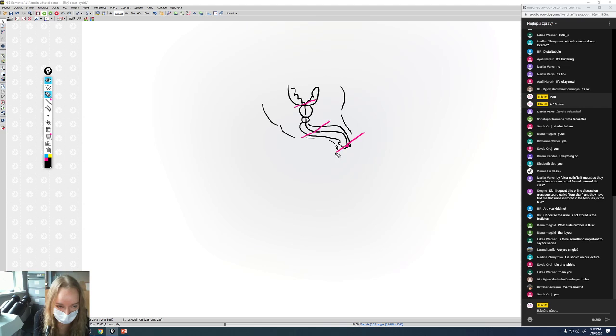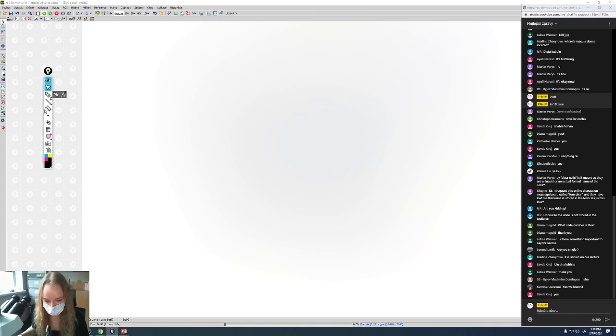And here in the fossa navicularis, I don't know if it's the same in English. Yeah, navicular fossa, thank you. It's going to be stratified squamous epithelium. So right now we're going to look at the penis and the urethra that is going through the penis. Let's take this one first. Okay, so we can change.